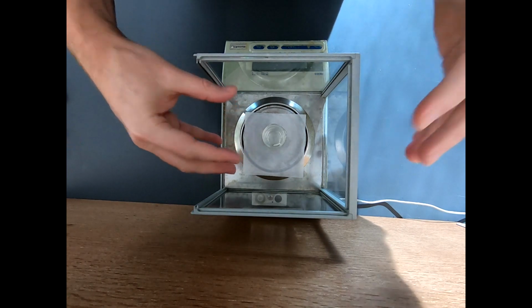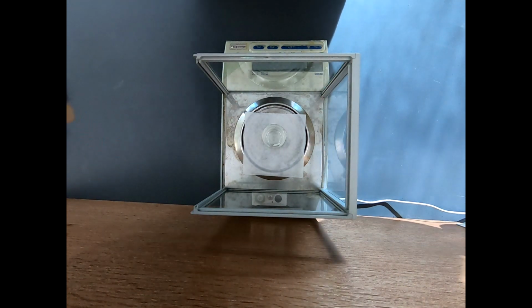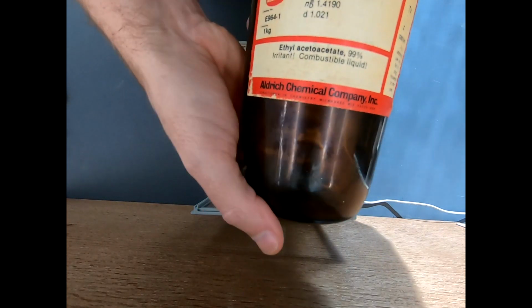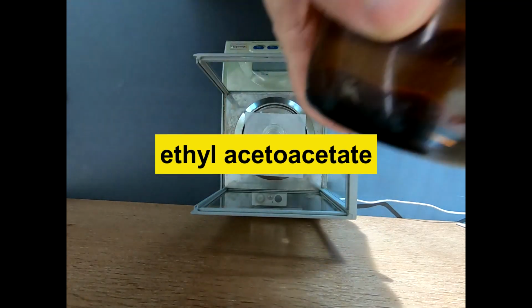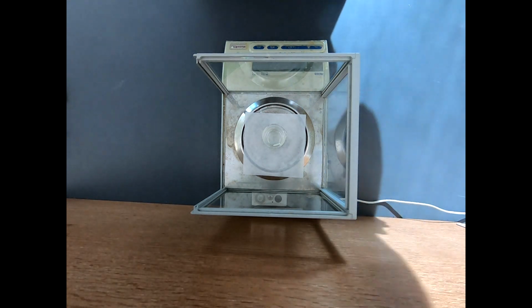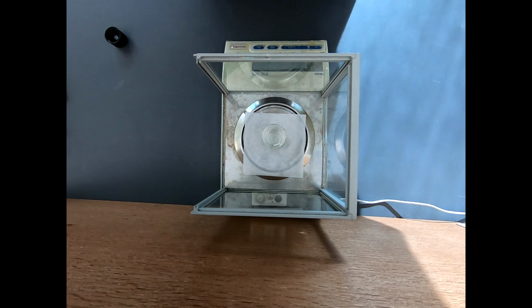Okay, I wanted to move that. You saw me try to move that, but I don't want to move it because I have a second reagent. I'm just going to add the other reagent right in this same beaker. And be careful with this. This is ethyl acetoacetate. As you can see, this is probably a collector's item. This is an old reagent, but that's okay. Lots of these reagents have a very good shelf life. And this will be just fine.